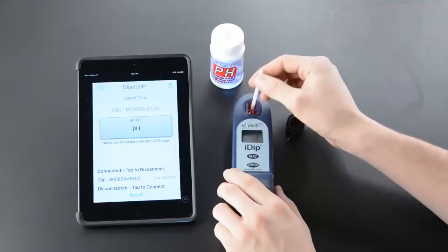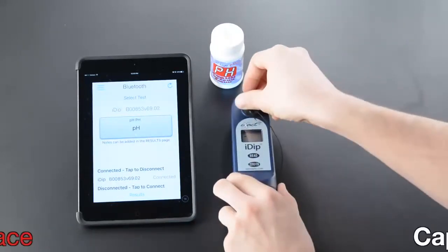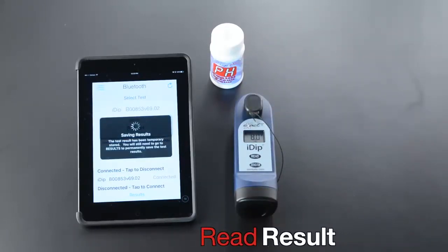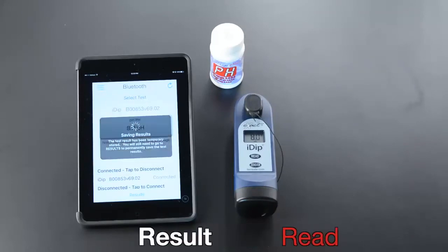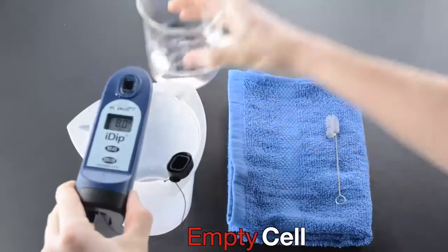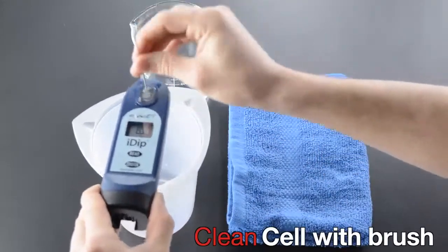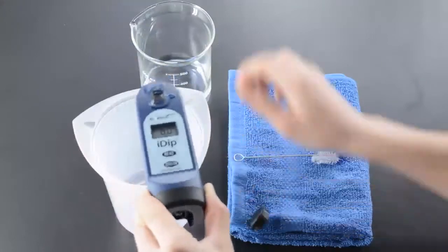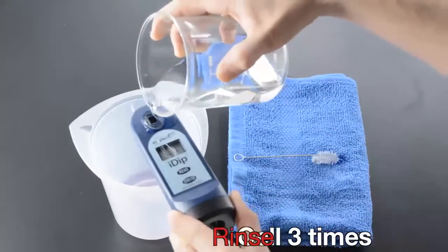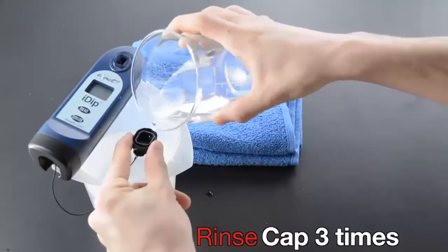Remove strip at one second, replace cap, read result. Empty cell, clean cell with brush, rinse cell three times, and rinse cap three times.